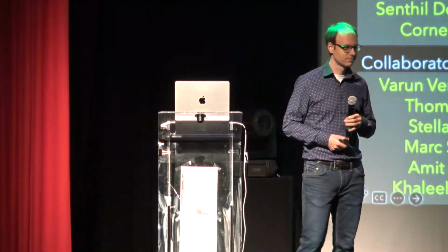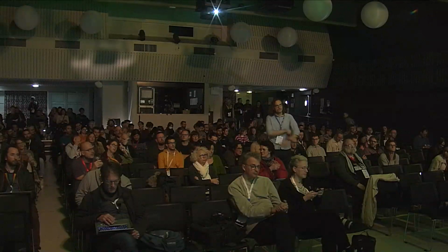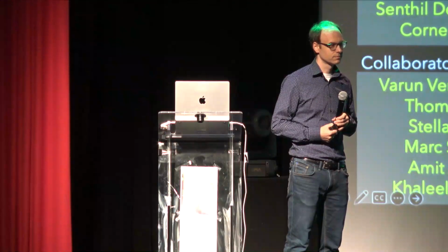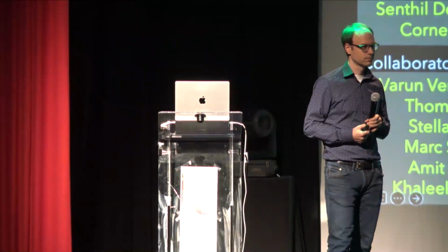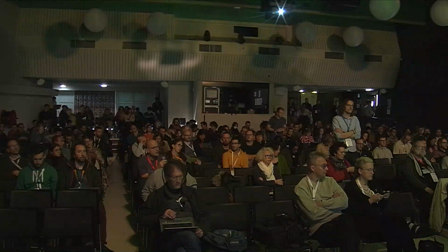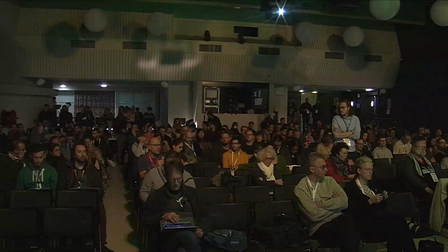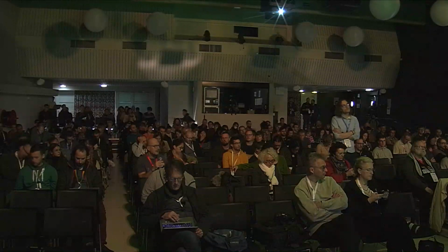Thanks a lot for the impressive talk and material. My question concerns essentially the constancy, or otherwise, to put it differently, the variability of the adaptive optics correction. I mean, how much does it change from one depth to the other? First question. How variable is it in time? I mean, how often do you have to refresh it when you do imaging? And the third question is, how variable is it from one individual to the other? For example, could one say, okay, I have sort of a zero order adaptive optics correction and apply this for all mice at a given depth?